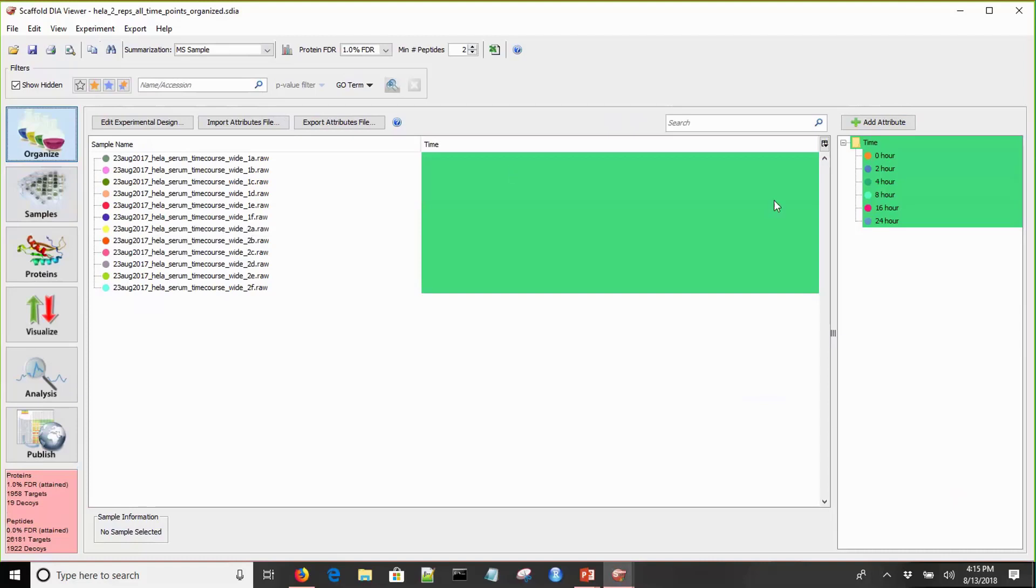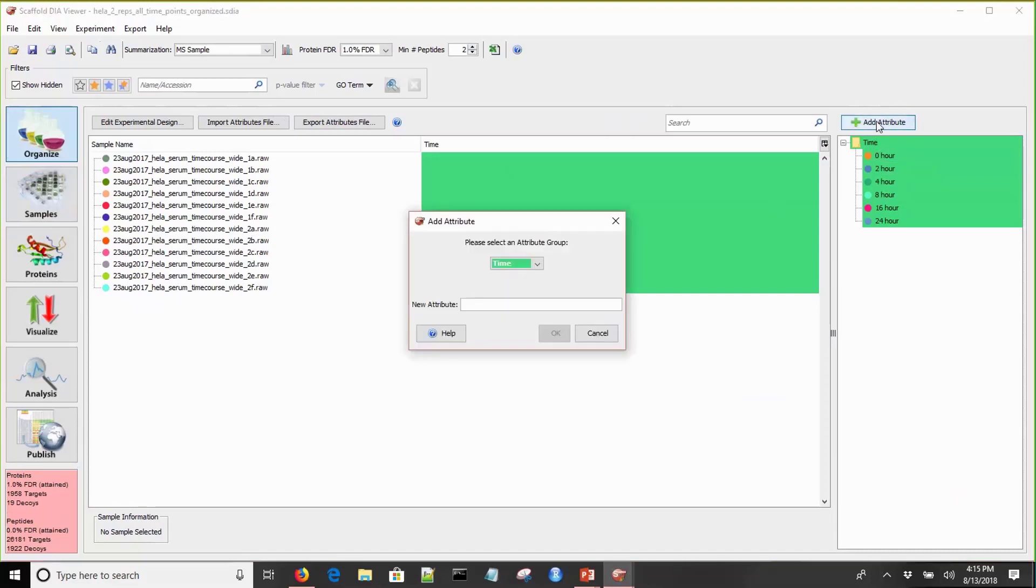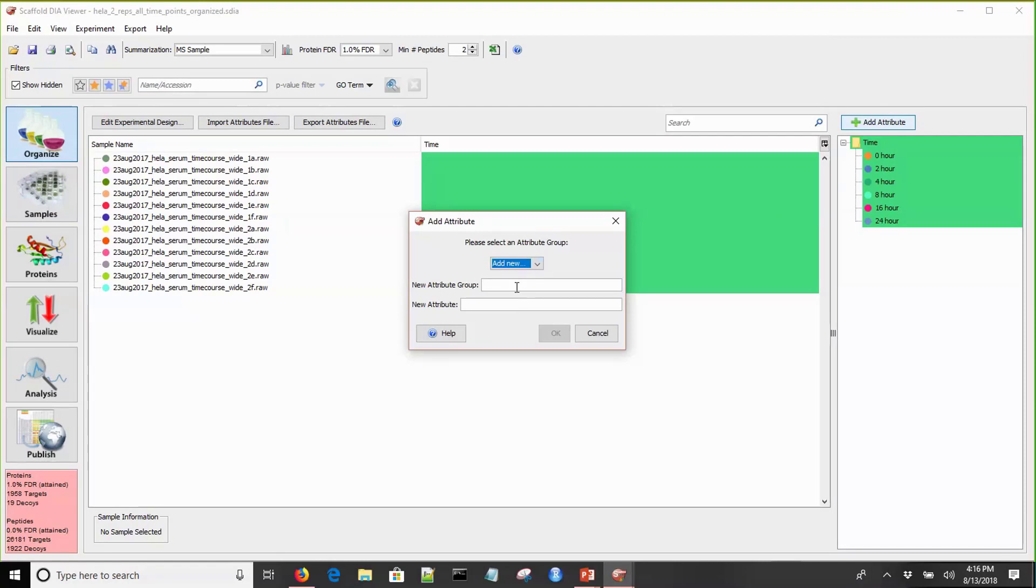These could be categories that help you understand what your samples are and then move that data into Scaffold DIA. This is done by adding attribute groups and then defining attributes within those attribute groups. This is a time course study that was done on multiple biological replicates. I've already created this time attribute group and defined a few attributes. Let's add a new one.